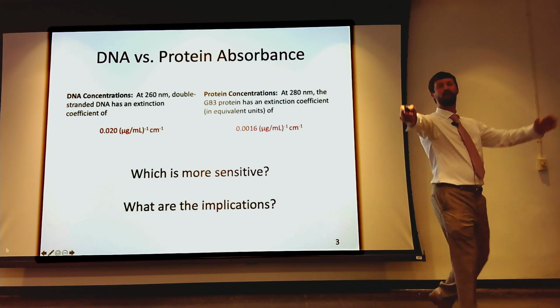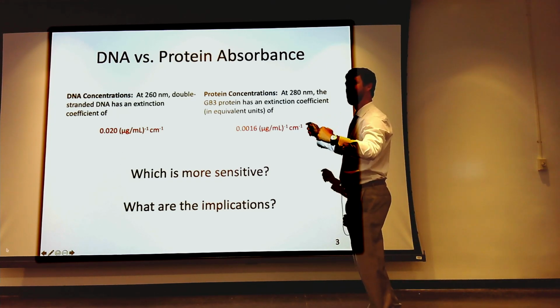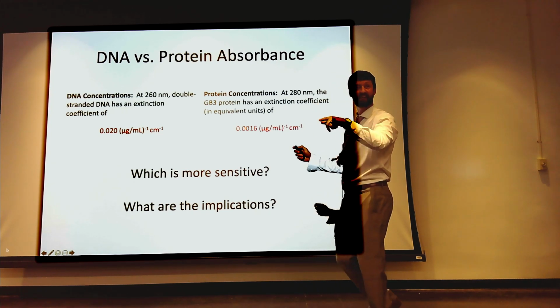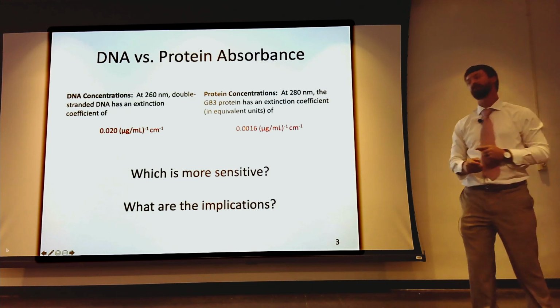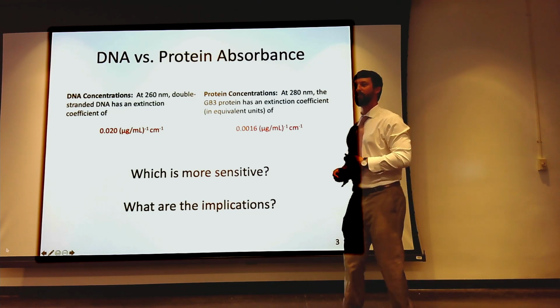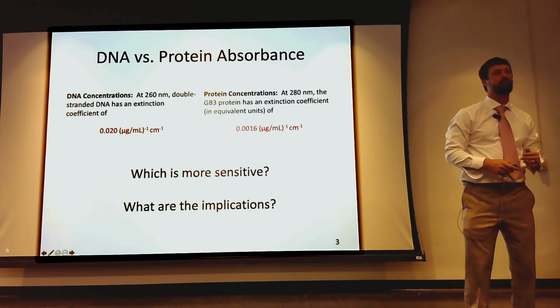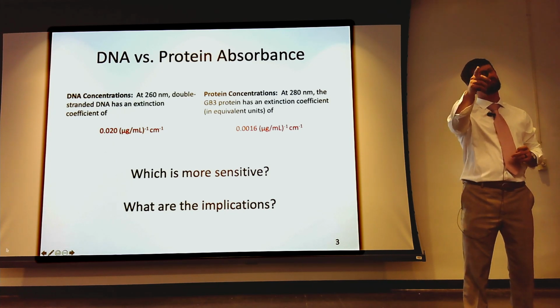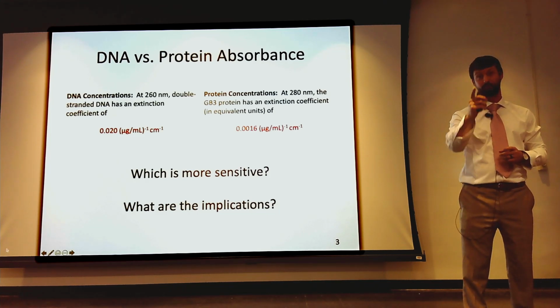All right, so Beer's law has some implications, right? A equals epsilon b c. Is it always true? Does it fail us? Yes, I see a head nodding, yes. Pay attention to this classic first-time mistake you get in a research laboratory. Your spectrometer may be the best spectrometer on the planet, but it's still subject to Beer's law. Where do you have to measure things? Between what ranges? 0.1 and 1, I argue. I always say 0.3 and 1.6 if your spectrometer is made for it.